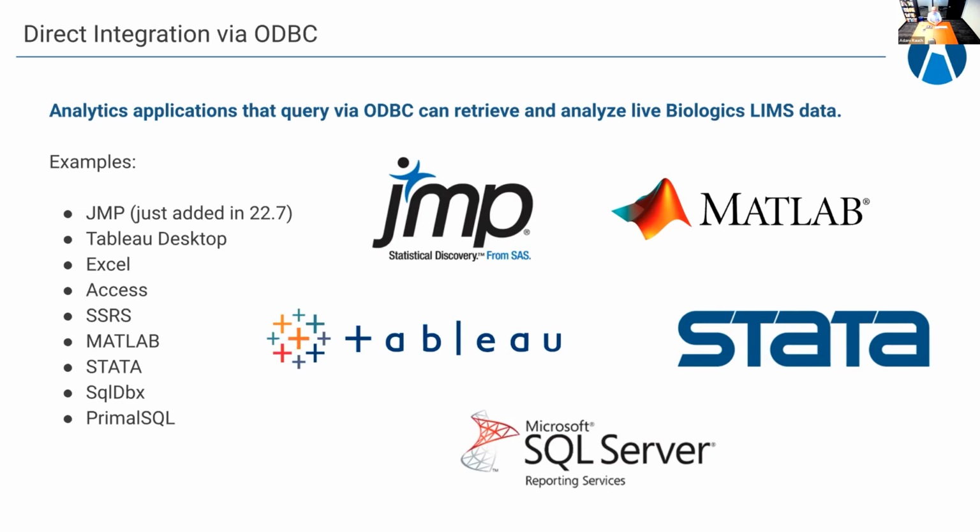Via ODBC, these tools can connect directly to Biologics and pull live data into the tool for analysis and visualization purposes. And if that data changes, it can be refreshed immediately within that application.